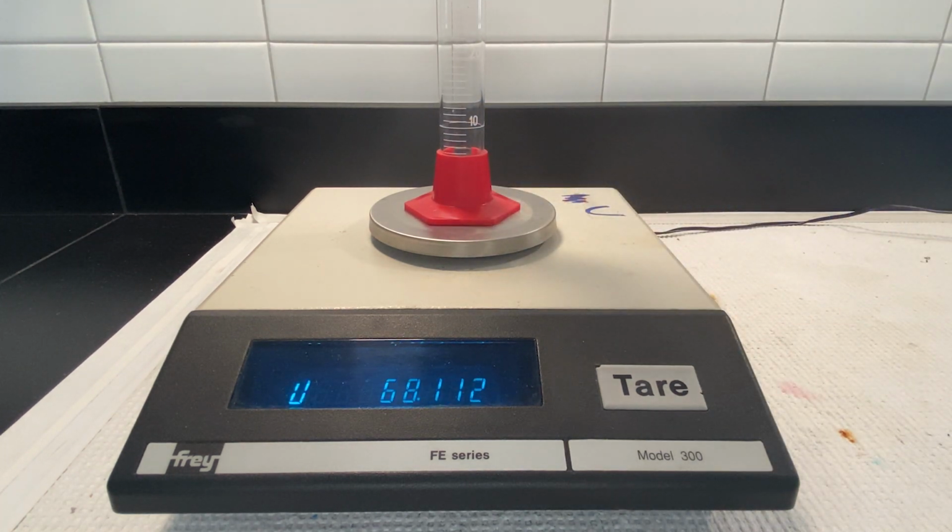Next, you'll make an analogous set of measurements for a graduated cylinder.